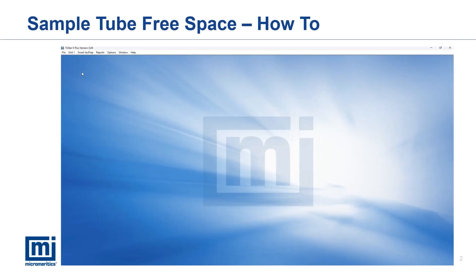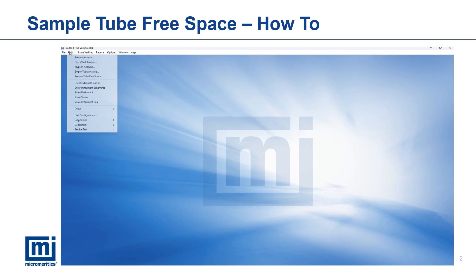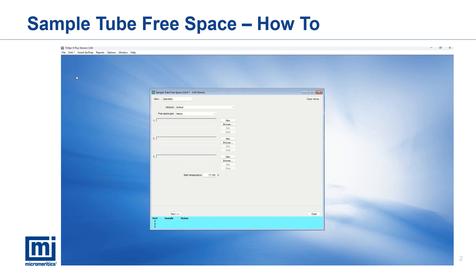In this demonstration the instrument used is a TriStar, but the steps are the same across all gas adsorption systems. In the instrument software, navigate to the unit menu then select sample tube free space. At the next window, ensure operation is selected for view. Select default in the method drop-down menu and choose the gas.